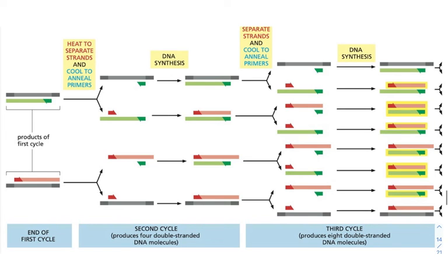And one thing I should note here is that when we make DNA in the lab via PCR and try to insert it into cells, we often use it in the form of a plasmid. Plasmids in nature are little circular pieces of DNA in bacteria. But wait, bacteria always have circular DNA, right? Well, a plasmid is a little bit different because it's not the core genomic DNA in a bacterium. The plasmid has what we like to call accessory genes.